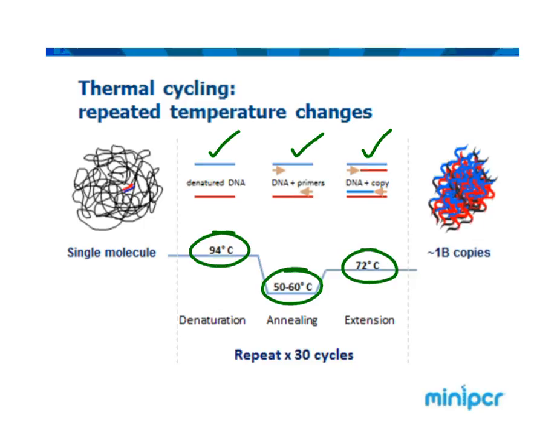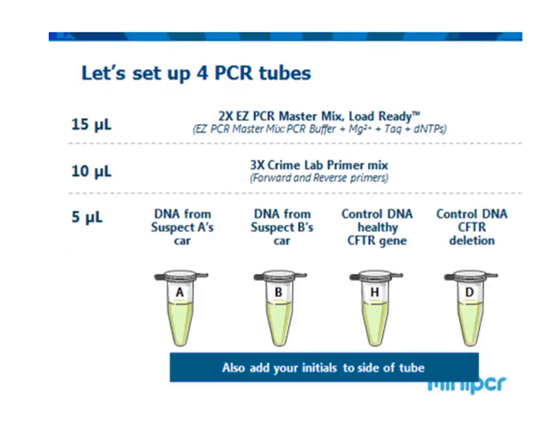Ours is 36 or 37 degrees Celsius. Its is 72 degrees Celsius. So that's why we use a very high temperature polymerase that came from a bacteria that can survive and flourish at really warm temperatures, since PCR requires really hot temperatures.